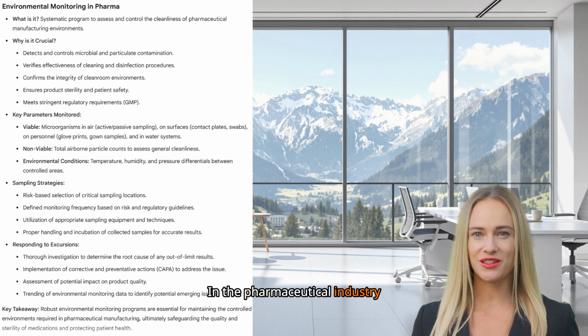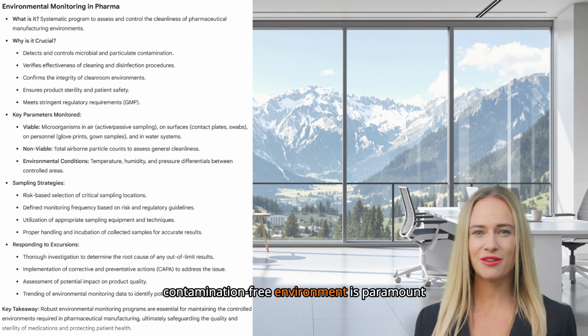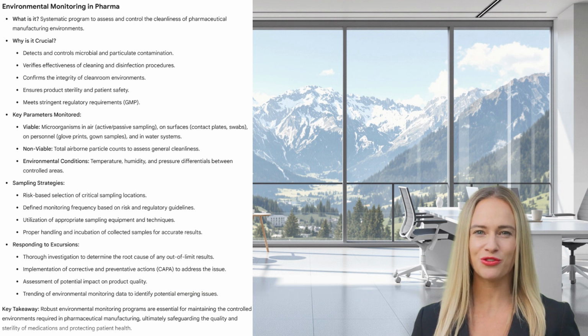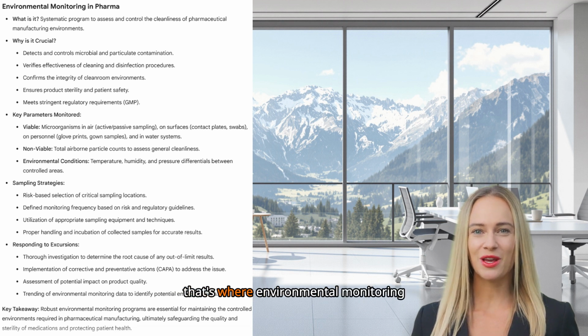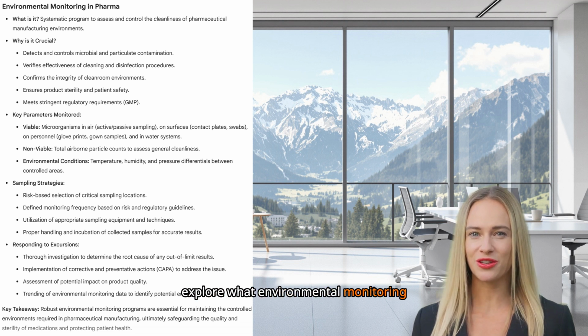In the pharmaceutical industry, especially when manufacturing sterile products, the environment in which these products are made is just as critical as the ingredients themselves. Maintaining a controlled and contamination-free environment is paramount for patient safety, and that's where environmental monitoring comes into play. Today, we're going to explore what environmental monitoring is and why it's such a vital aspect of pharmaceutical GMP.